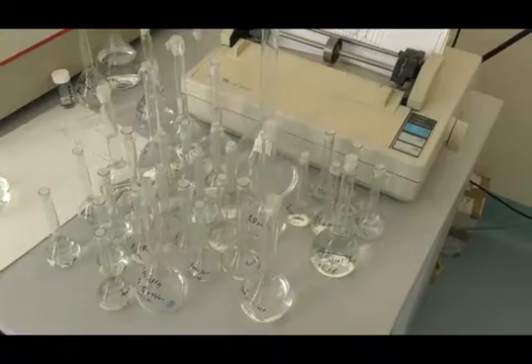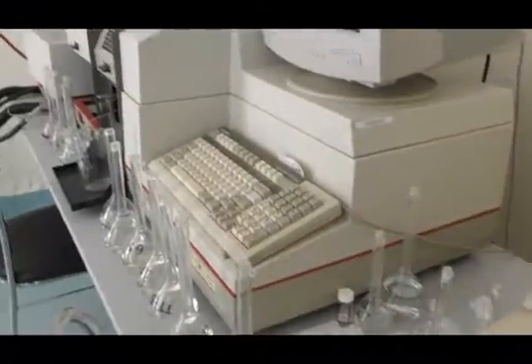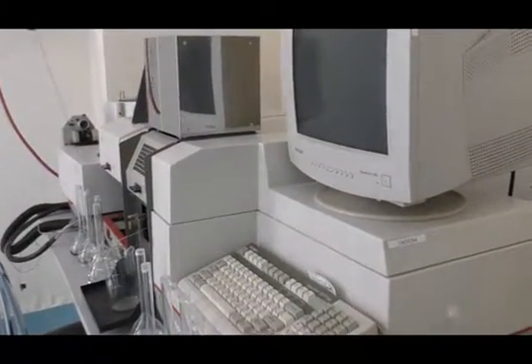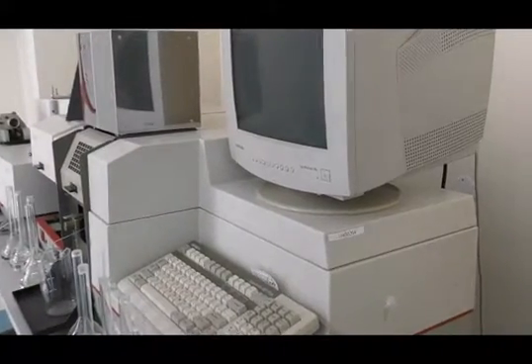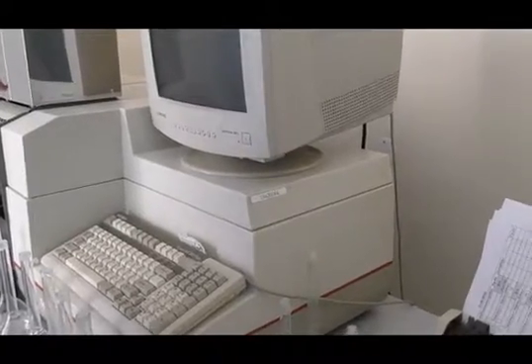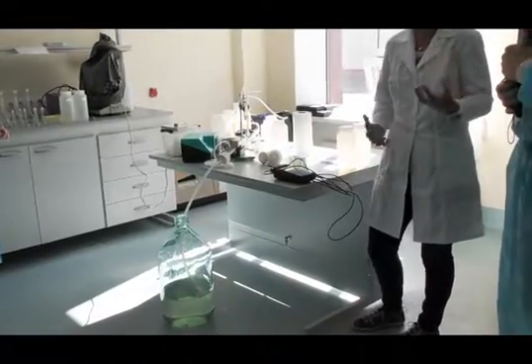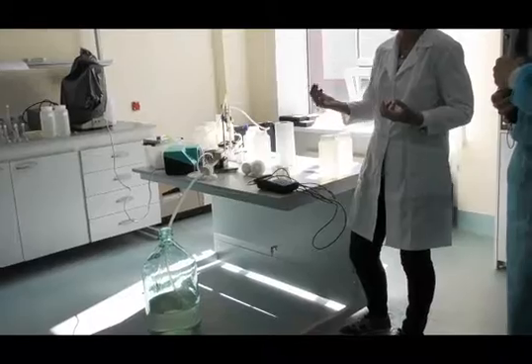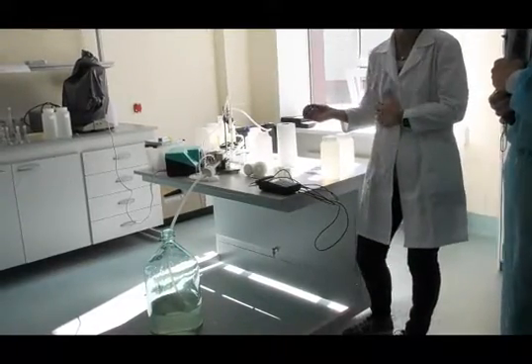But even though it's so much better to do it out in the field, if you work in estuaries or some other systems where different water quality meets, in the meeting points you will have chemistry that is very changeable due to pH. And if you remember, we said yesterday that you should acidify the sample out in the field. But if you bring the sample into the lab to fractionate, you can't do that in the field.